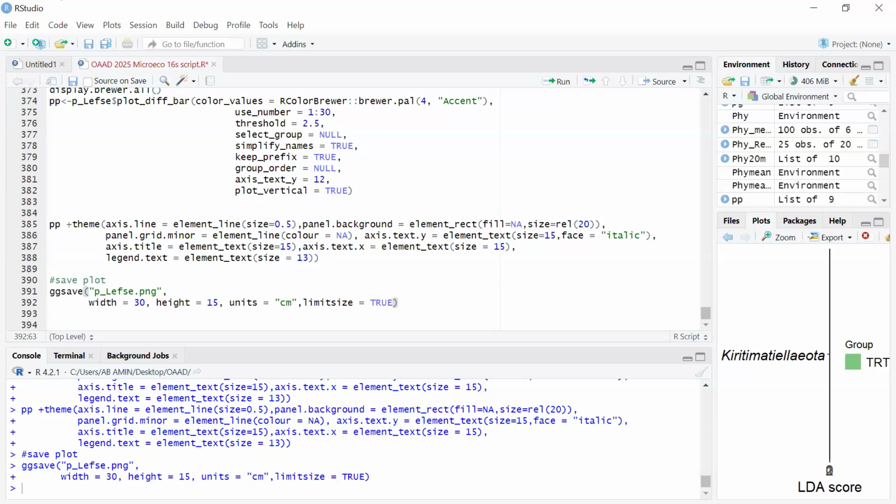What we do, we pick them from the fermentation media and put them on the plate. We take different colonies, looking at the morphological characteristics, and based on that, we choose different colonies and send them for sequencing. After sequencing, you blast, and after blasting, you can identify. For us, because we are mining lactic acid bacteria, we are not so specific.